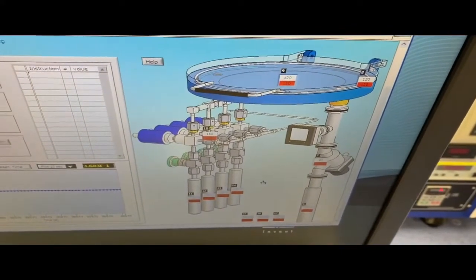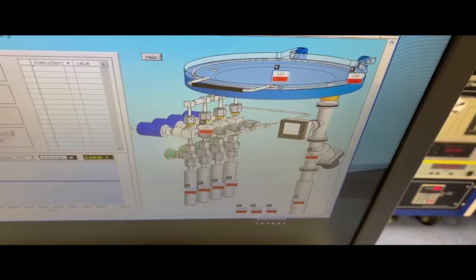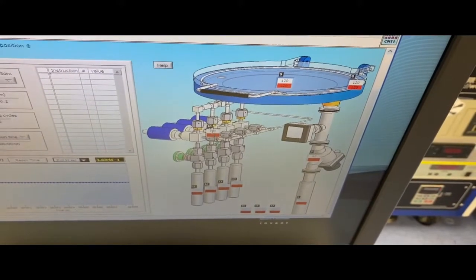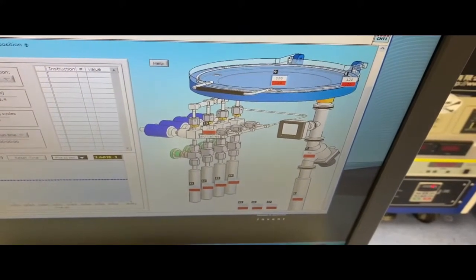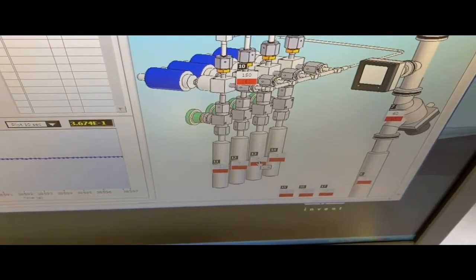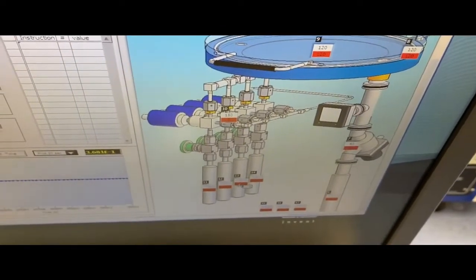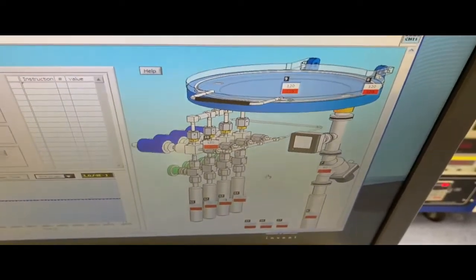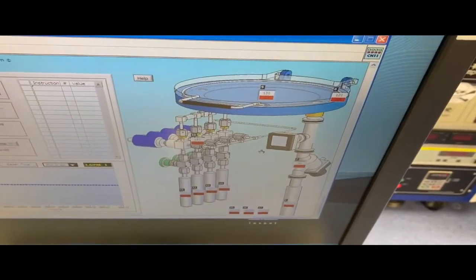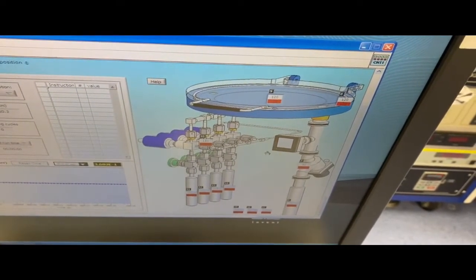In order to make the machine function properly and protect our system from damage, the temperature of the heater 7 should reach 60 degrees, and the heater 10 should be up to 150 centigrade before your deposition. If you want to deposit a titanium oxide layer, the temperature of the corresponding precursors should always be set to 70 degrees. You can set it here. And when the temperature has reached the targeted temperature, then you can start your deposition.